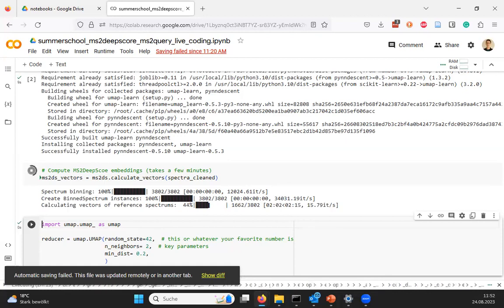The only thing we have to worry about is what you give as an input to MS2DeepScore. This is why I, for example, removed the spectra with only 1 or 2 peaks. It will not complain, it will work for them too, but I don't trust the results very much. Other than that, you don't have to do a lot of pre-processing.